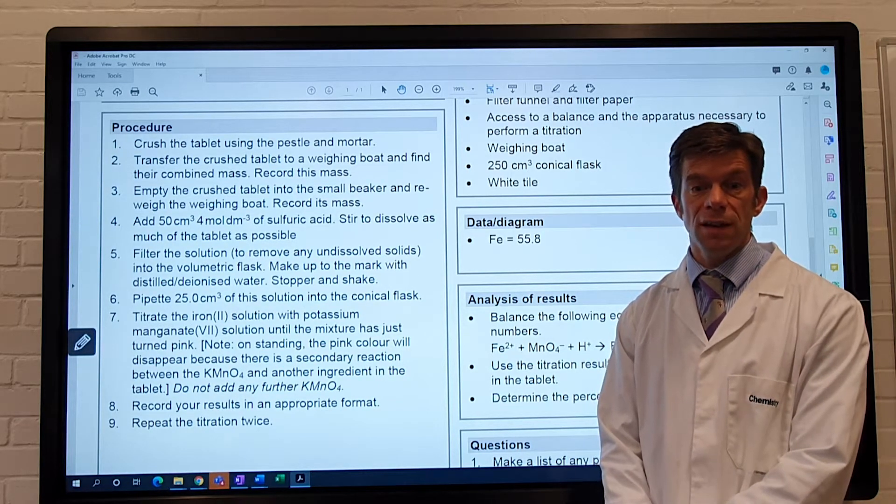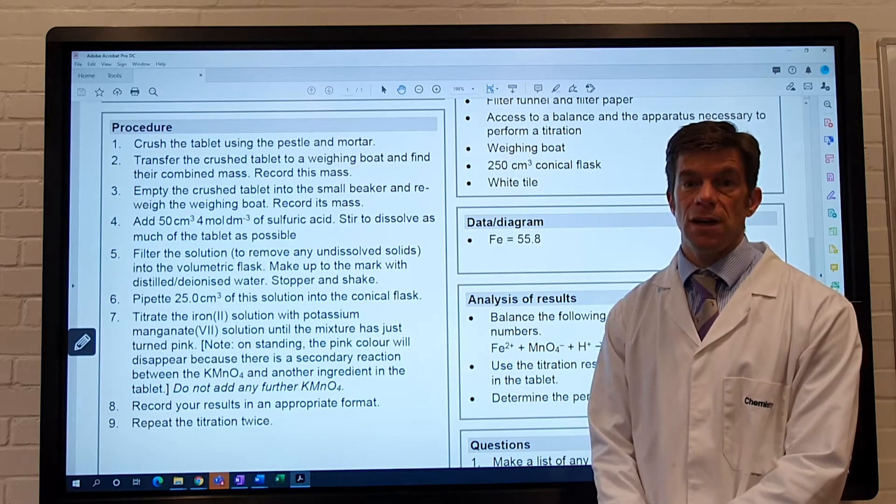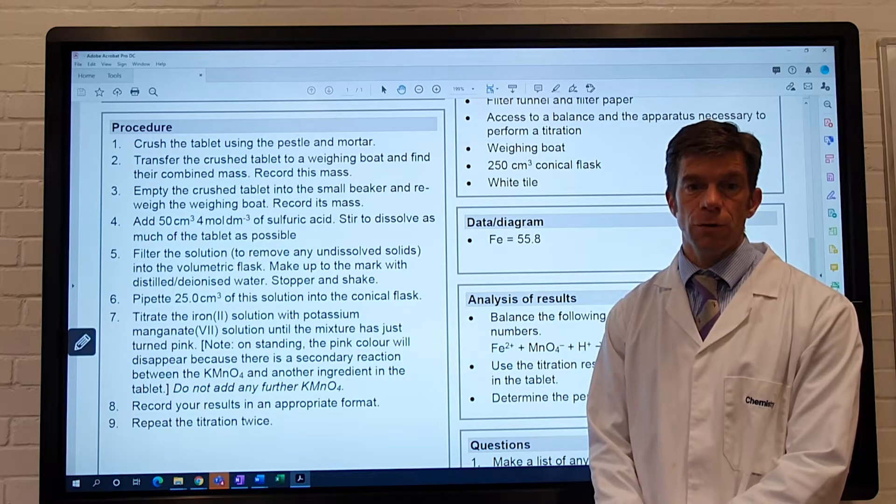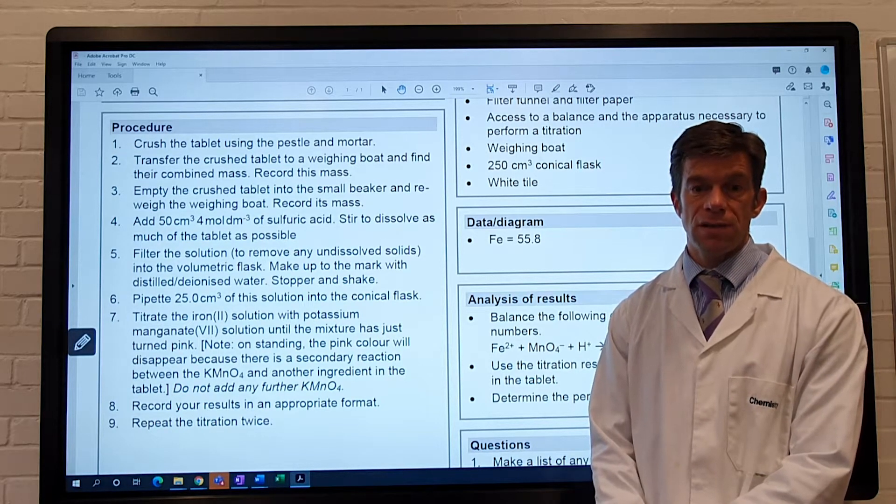Now note, on standing a pink color will disappear because there is a secondary reaction between the potassium manganate and another ingredient in the tablet. So don't add any further potassium manganate.